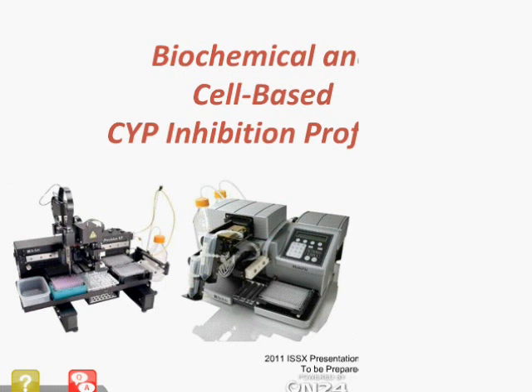The reason, again, as previously explained by Tim, is that there has been a recent push by ADME-Tox researchers to generate CYP inhibition data using cells instead of a more purified enzyme format because, again, as was previously mentioned, the cells contain the full complement of enzymes which can affect the availability of the compound to the cytochrome P450 enzymes. So our goal here was to validate whether or not this is truly a valid hypothesis.